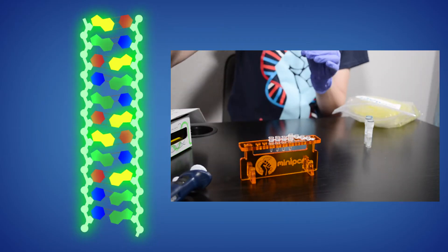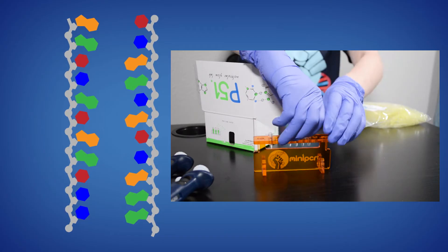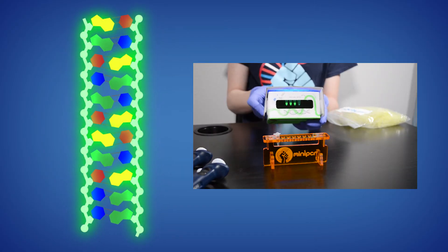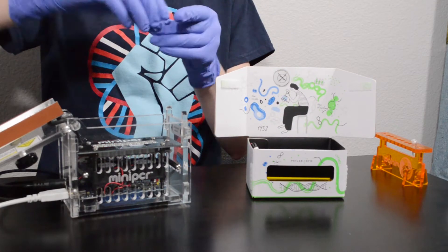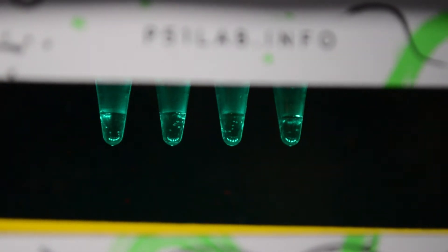In this lab, students will use a fluorescent dye that binds to DNA when it is double but not single-stranded, allowing them to explore the structure of DNA first-hand. Students will visualize changes in DNA by observing changes in fluorescence. As the conditions are modified and the two strands of DNA denature, the DNA in the tube will stop glowing.